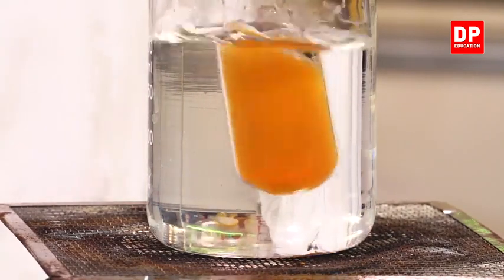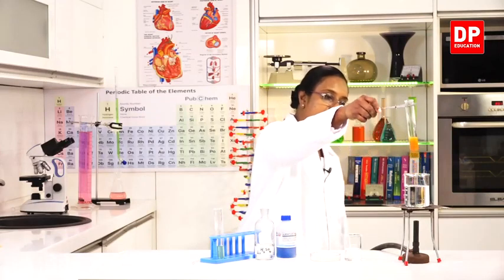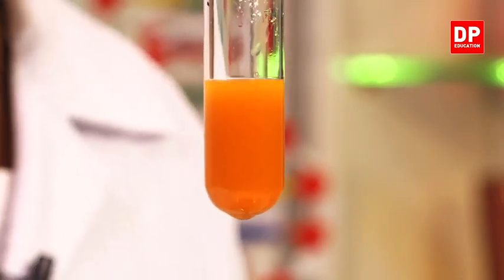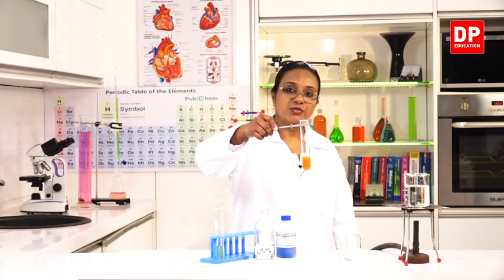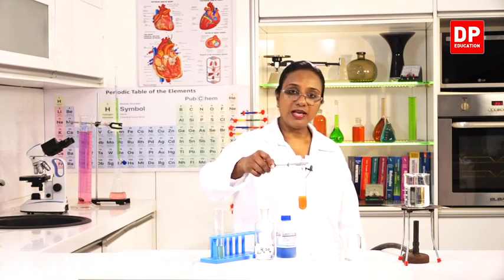And now you can see the appearance of a brick red precipitate at the bottom. Although the solution is orangish in color, you can see a deposit at the bottom of the boiling tube. So this is the color change that you have to obtain.